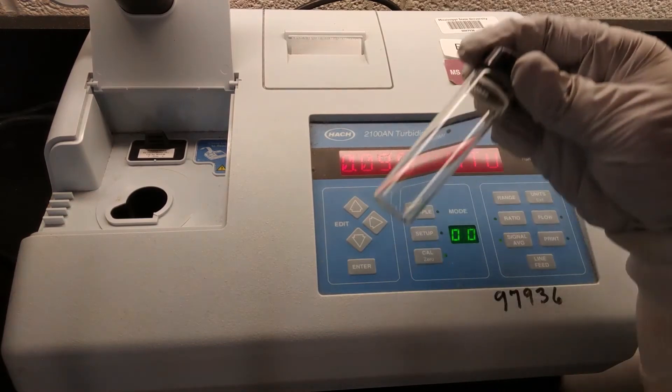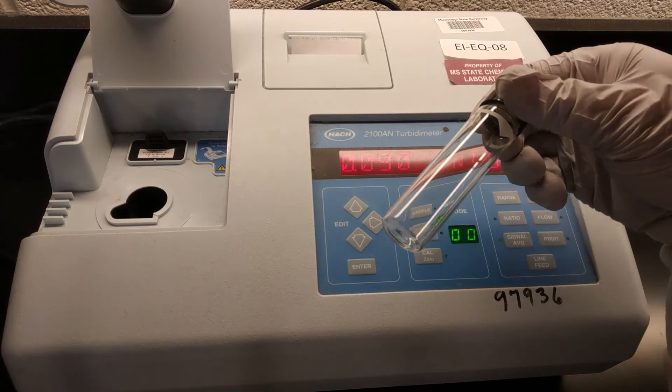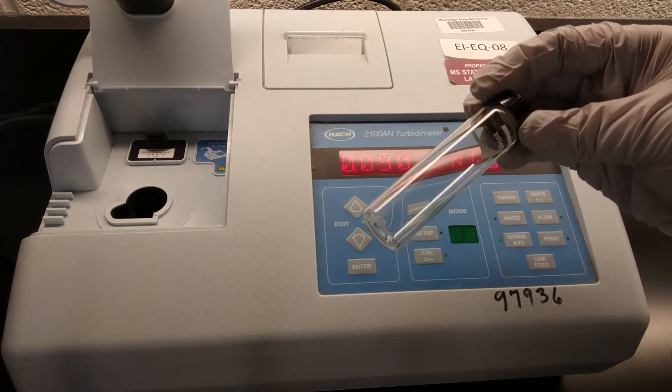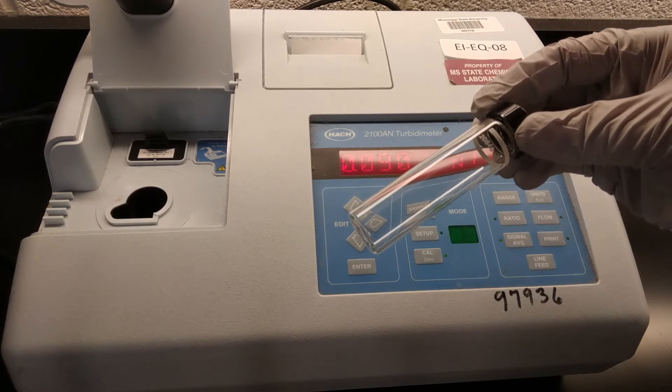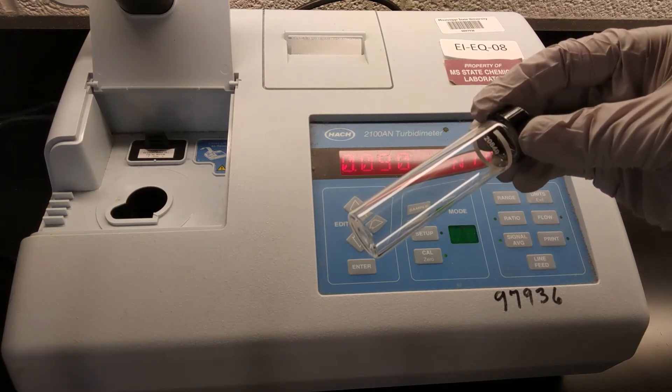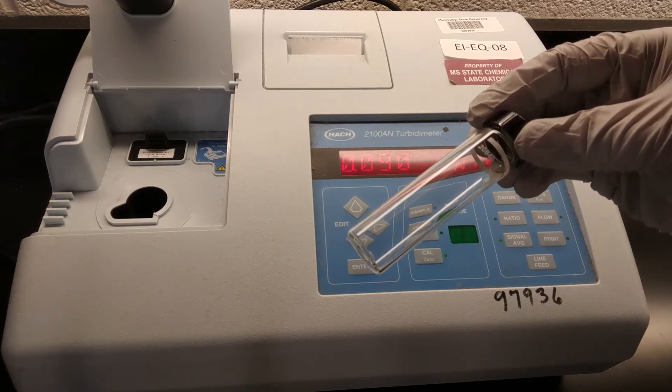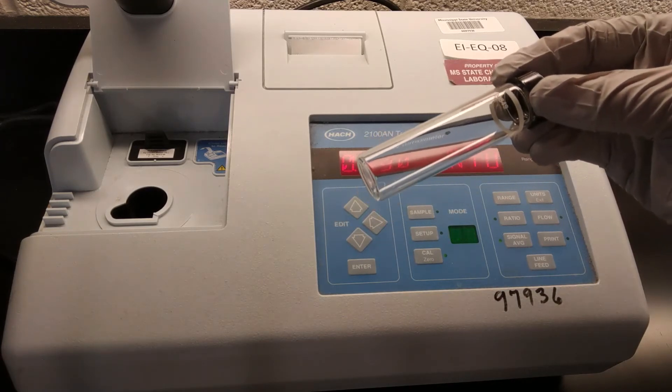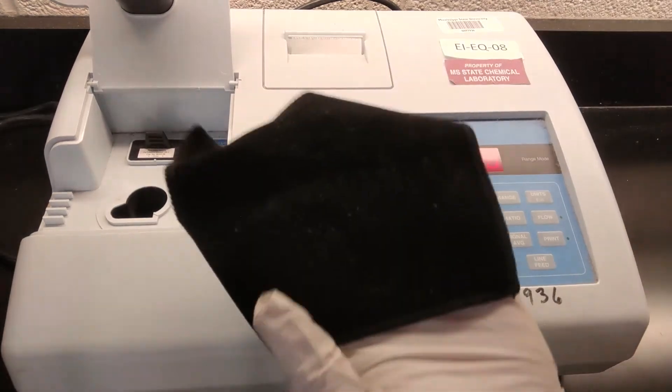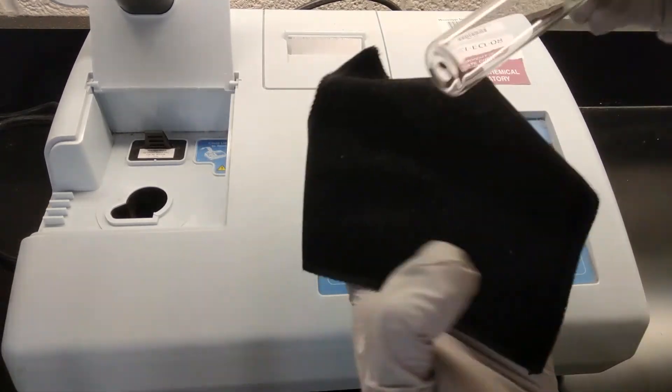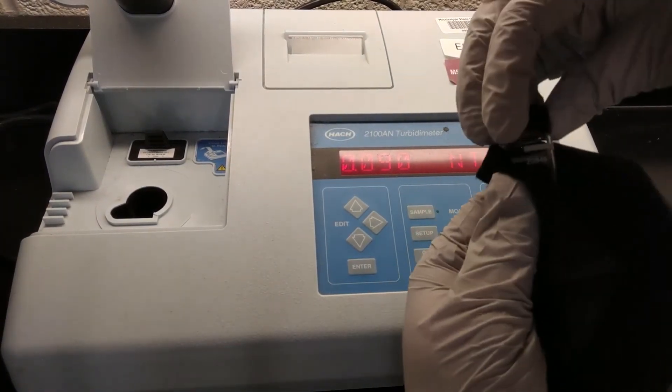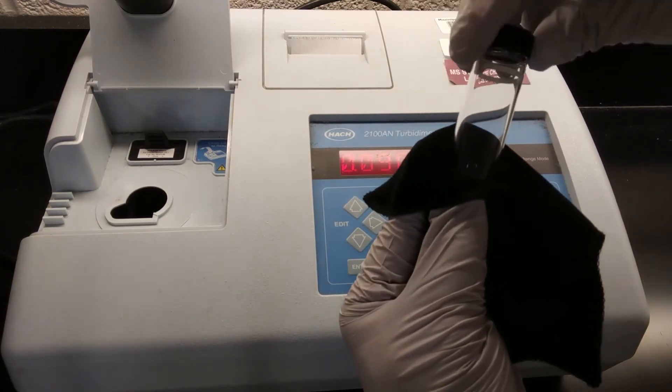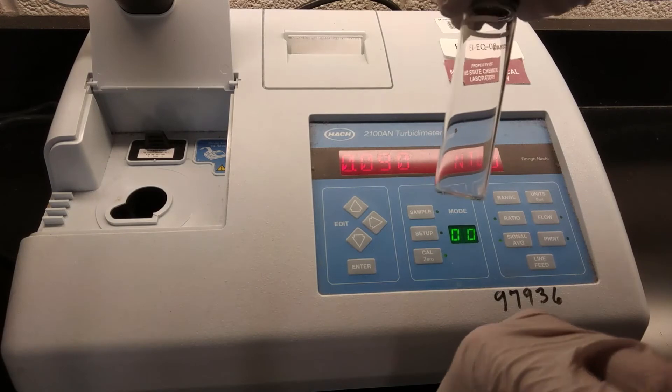One thing that you may notice when you take these cells out of their container is that there might be a little bit of dust or little smudges on the outside of the cell. If that's the case, you do not want to try and wipe it down with a chem wipe or a paper towel. Those could potentially introduce very tiny bits of debris and scratch the glass. And if we scratch the glass, that's going to interfere with the light passing through it. So we have this little microfiber rag that we use to just wipe off the outsides of our cells. Make sure that they look clear. Nothing that you can see with your own eye should really be standing out.